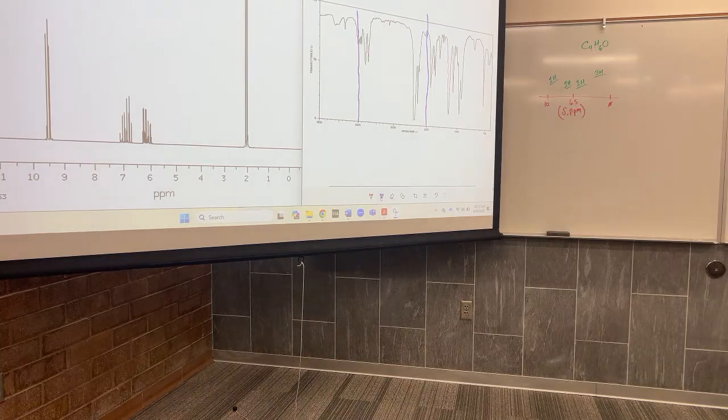No, but close. No. This actually only produces 2 signals in the NMR. So there should be like 4H, 2H.